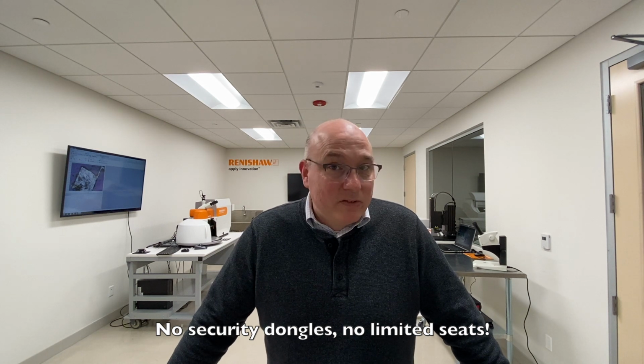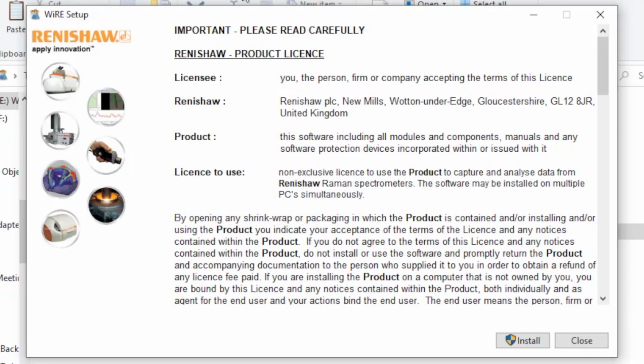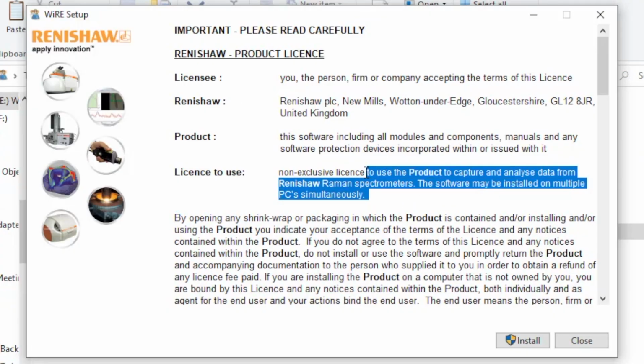Before we get started, there's a couple things that you might need to know. One, this is okay. You can install multiple copies of the Renishaw WiRE software. The license in the program clearly states this. It says the software may be installed on multiple PCs simultaneously.